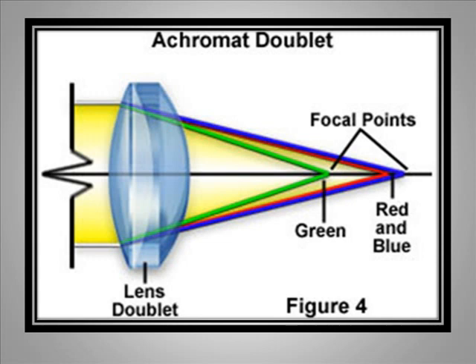The majority of lenses used in laboratories today have objective lenses that correct for these aberrations. For example, when two lenses, such as crown glass and flint glass, that each have different refractive indices and dispersion properties, are melded together, they are able to bring blue and red wavelengths to a common focus point near the green wavelength. This lens combination is known as a doublet and is found in achromatic lenses.